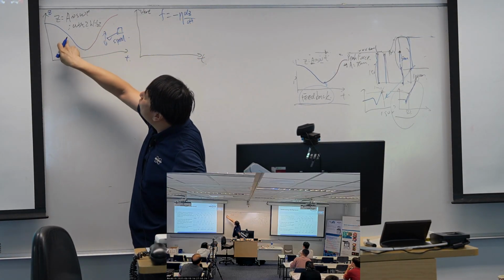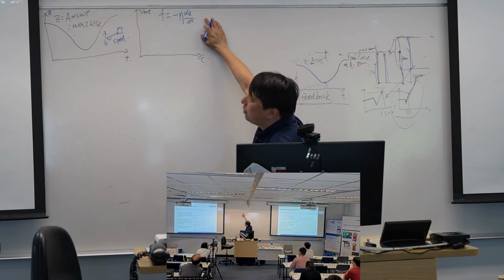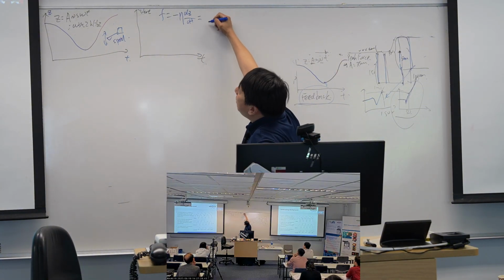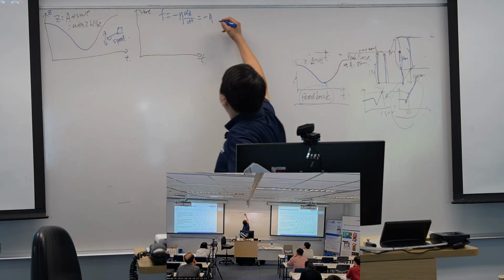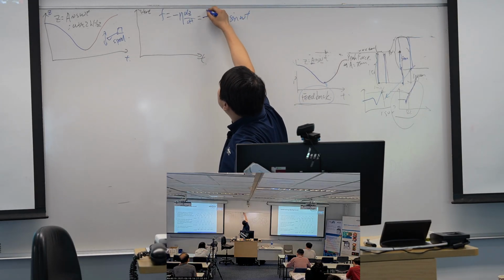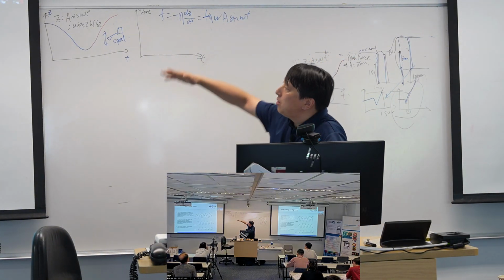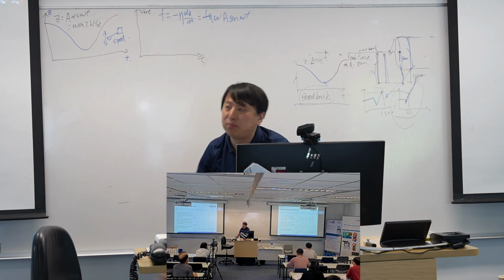So the friction we sense changes according to this. It will be negative eta, and since this is cosine, differentiating gives omega and a sine omega t, with a negative sign out front, so this one is positive. That means when the probe is moving down, the Z is moving down, and the probe will face a force up.